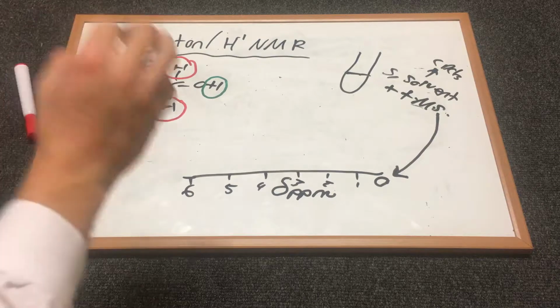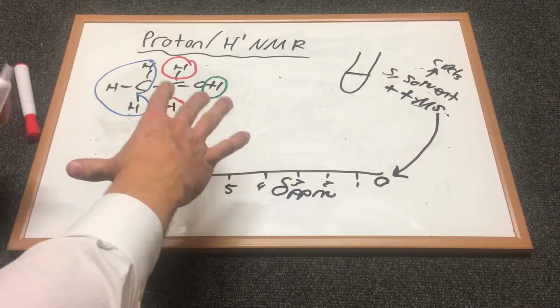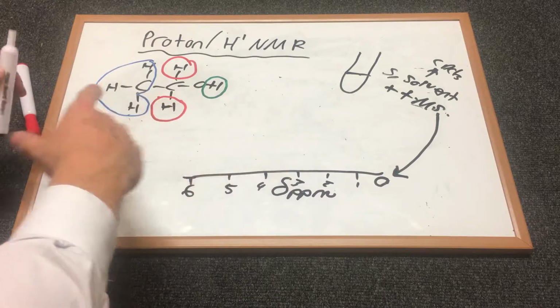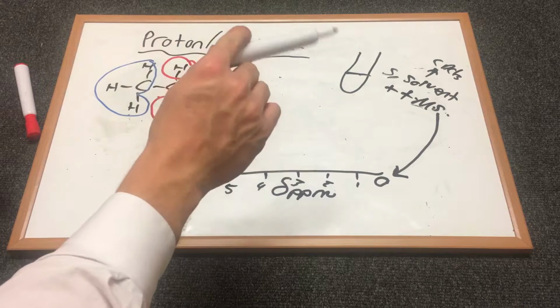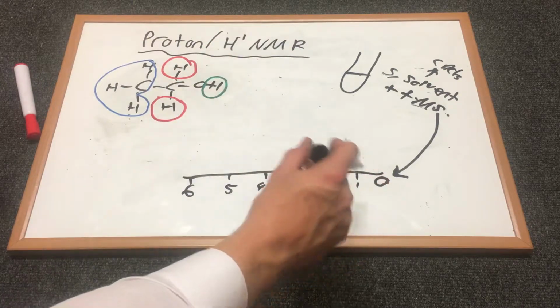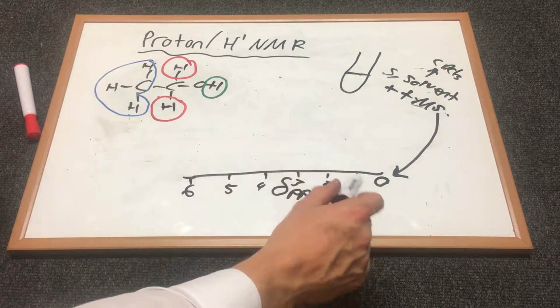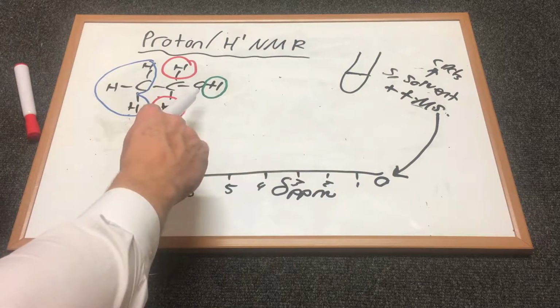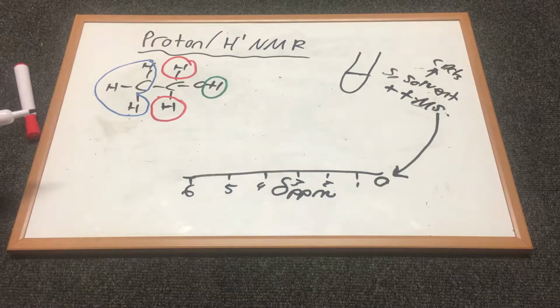In an exam situation, or when you're doing any assignment, or even just for practice, you should always be able to find a carbon-13 and a proton NMR chemical shift data sheet. In this case, I've researched it and found the following chemical shift values for each different group.